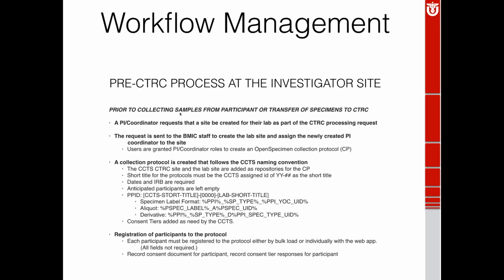So we have a standardized naming structure for our studies, which most folks and sites probably do as well. That kind of thing sets it up so we can actually easily identify samples as they move through all the workflow, whether they're samples that end up leaving the CTRC and are in the lab, or stay in one of the freezers in the CTRC. It's easy for us to track those down.